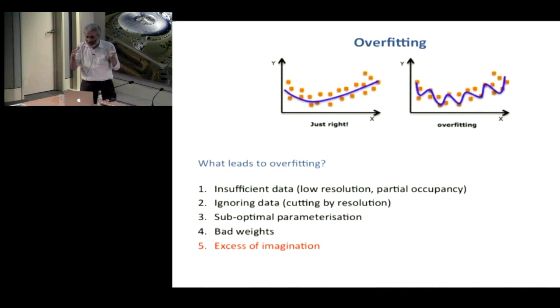So when we do reconstruction, what happens? If you think about reconstruction, what we have are the projections, and using the projection slice theorem, we reconstruct in Fourier space and average planes from different projections. At the end, we have points in Fourier space, and they will be correlated with each other.